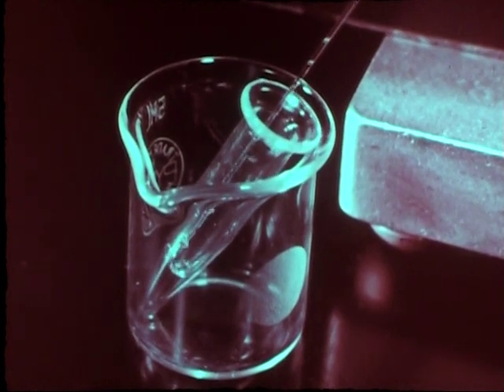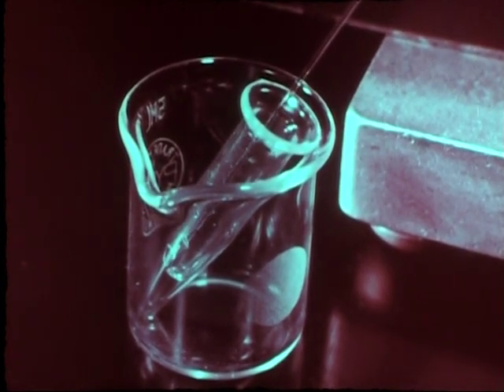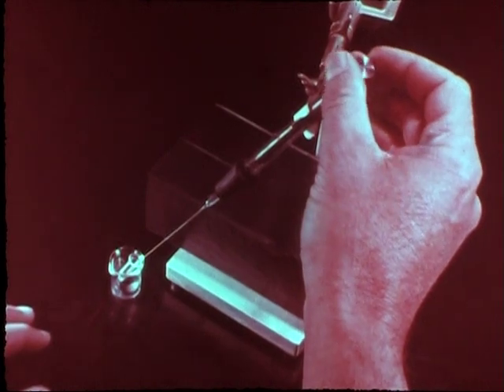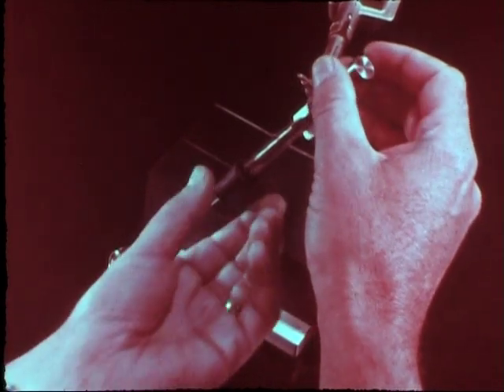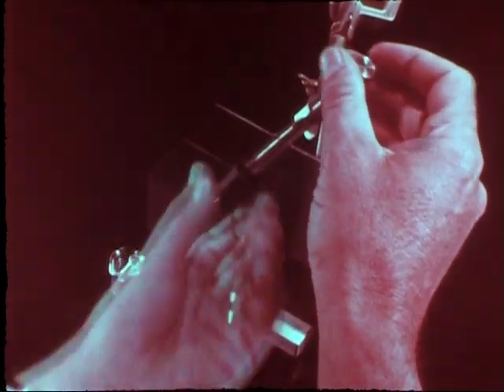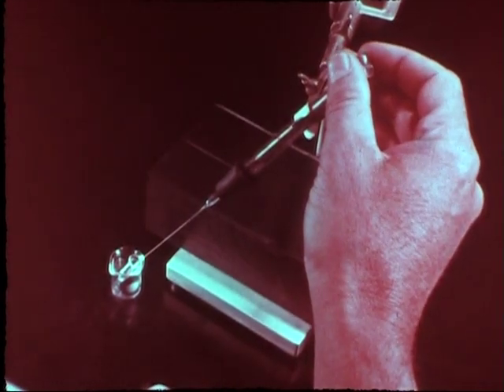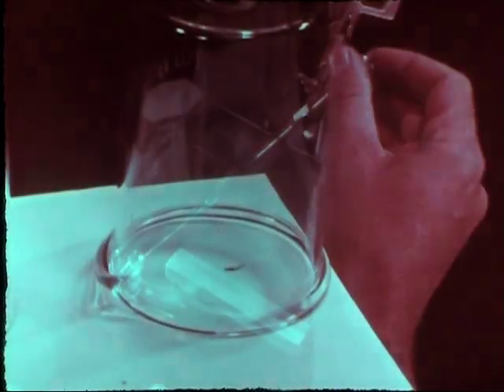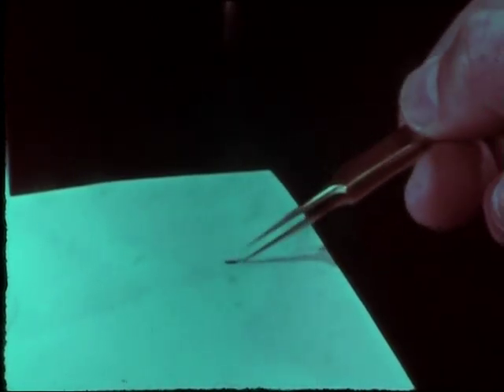Thus began the first successful weighing of pure plutonium accomplished by a team of microchemists under the direction of Glenn Seaborg.